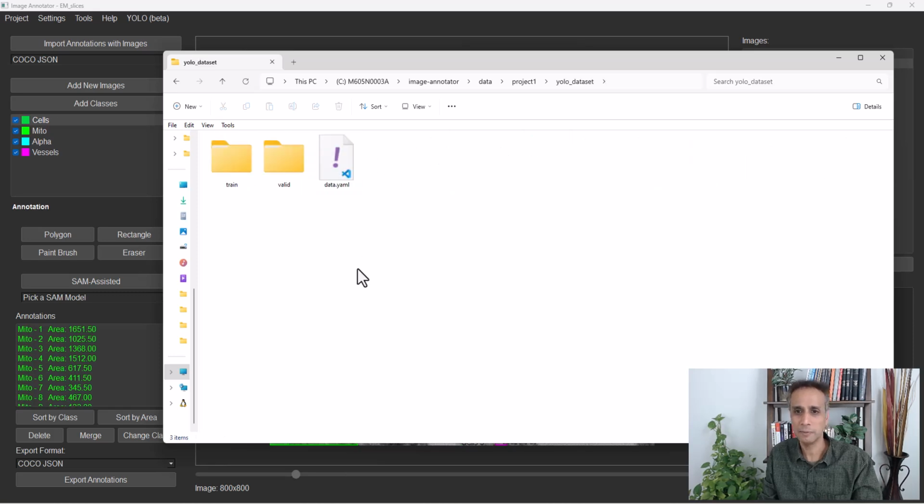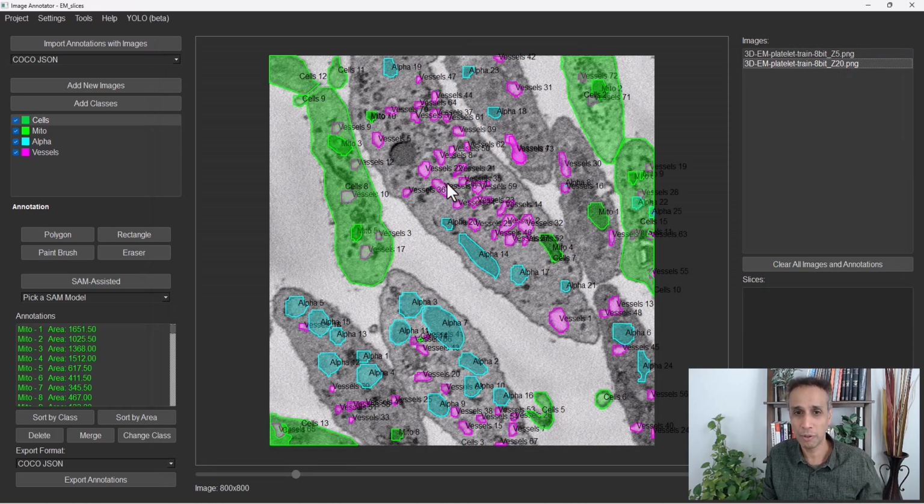So it's basically nothing but your data.yaml, like any other YAML file for YOLO dataset, your training images, images and labels, and your validation images. In this case, I'm only dumping the training images and not the validation, and I'm using training images as the valid images. I didn't implement the entire process. This is a shortcut to actually train a model, so you can use that model to further segment your images if the model is good, to automate your segmentation.